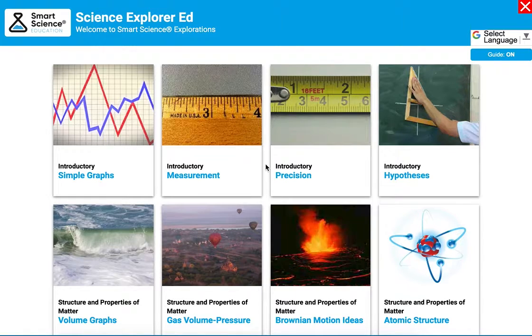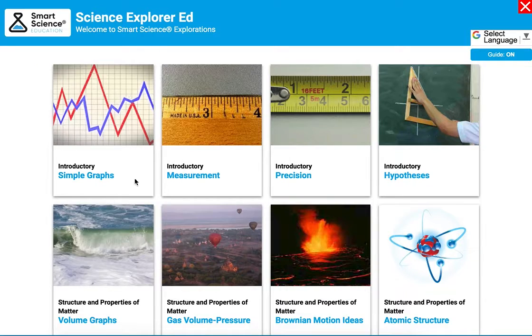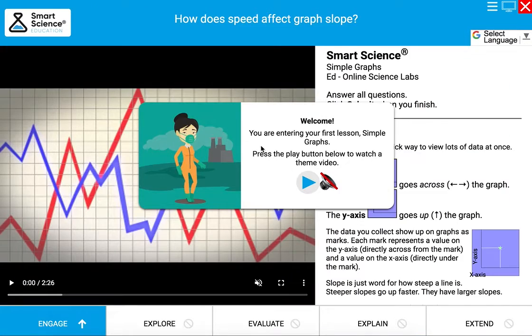Now you have logged into Smart Science and you're ready to start the student experience. This is also great for teachers who want to preview labs and try them for themselves. I've logged in and I'm just going to pick the first lab by clicking on it. Once you enter the labs, be sure to follow the instructions on the screen.